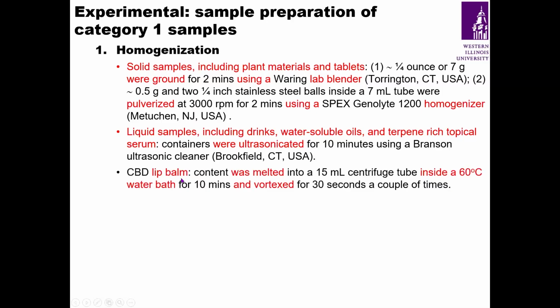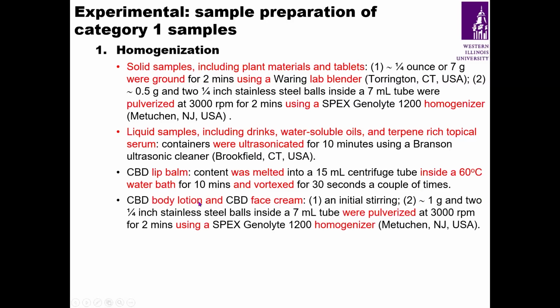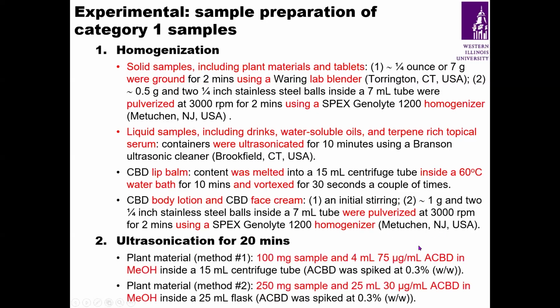Lip balms were melted inside a 60-degree centigrade water bath and vortexed a couple of times. Body lotion and face cream were pulverized using a homogenizer listed here.